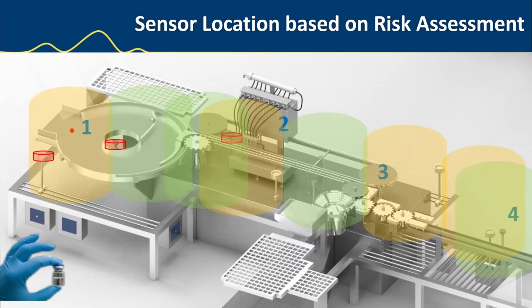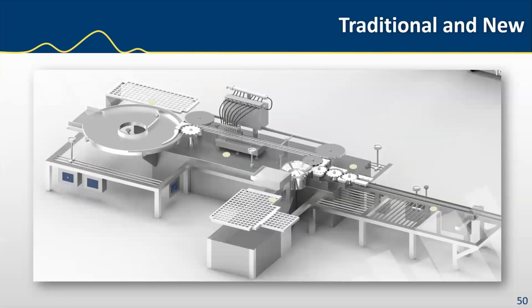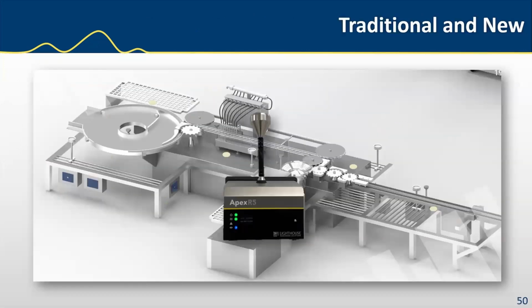And again, these are some of the locations with air sampling devices, these remote active air samplers, just highlighting them. And we also have some particle counters there. Looking at the implementation, I will include, obviously, settle plates, which I've included in this drawing here, you can see, and the active air samplers as well. So you have the trifecta approach here with 3 different data sets.